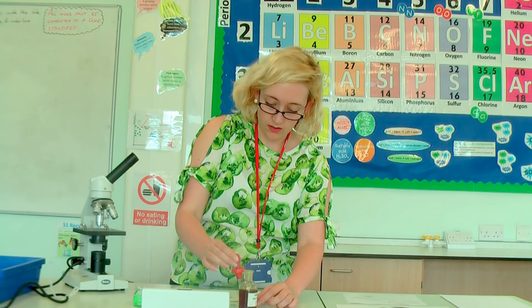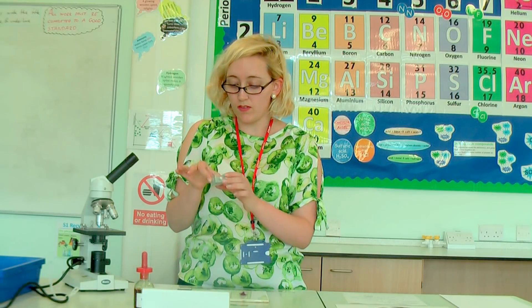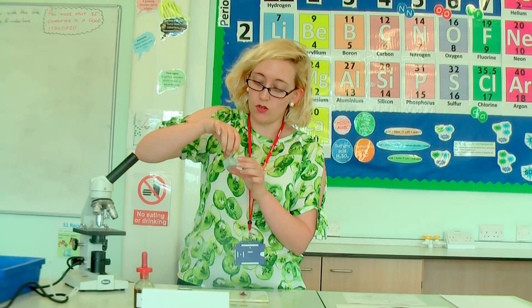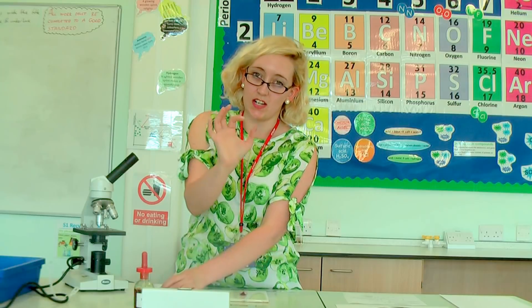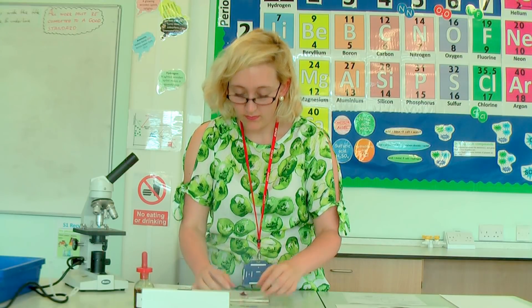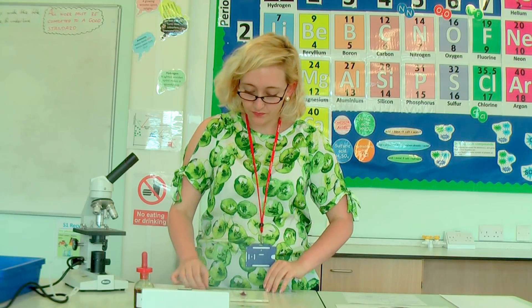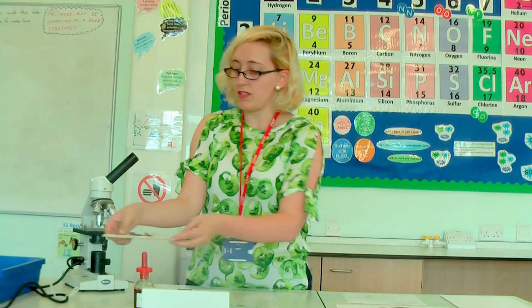Then I put my cover slip on top of that. It's very important when you're touching the slides and cover slips to only touch the sides — you don't want to get your greasy fingers all over the top because then the only thing you'll see is your fingerprints. So that goes on top. Easy — I've made my slide. I'll put my white tile, scalpel, forceps etc. to one side and we'll have a look at the microscope itself.